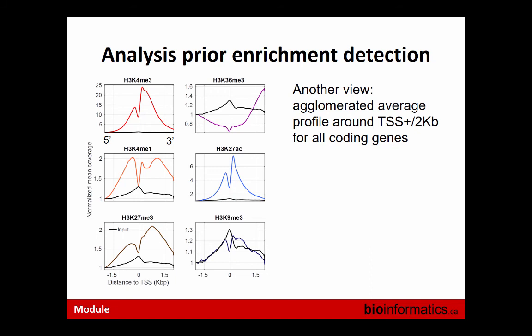And anecdotally, this type of plot, which I just calculated for the sake of this presentation, say 5 years ago could be published in a journal. It was news. Now it's routine for us. We look at those and think of this as a type of QC. If those profiles look the way they do on the screen, then the data is okay.